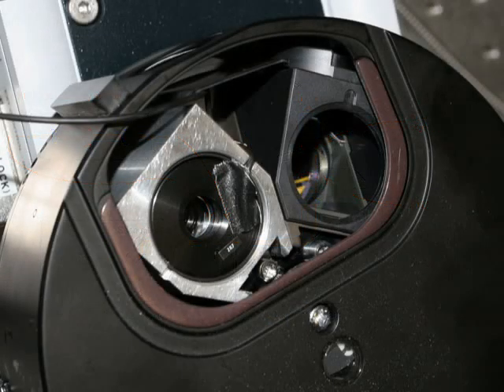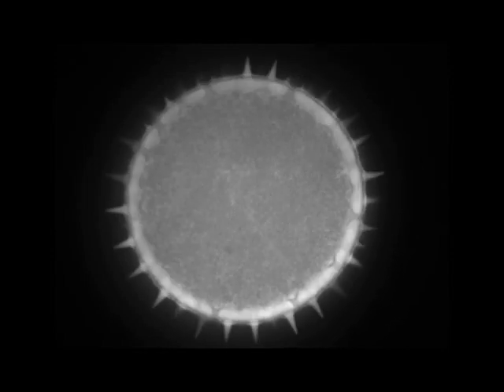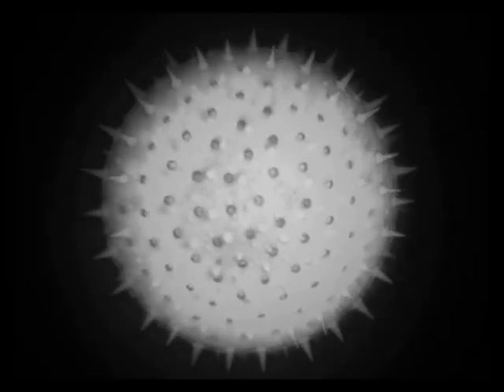In this example, the EL-1030 was placed into a custom filter cube. Again a pollen corn was scanned; in this example the range covered 60 microns. And here we see the corresponding maximum intensity projection.